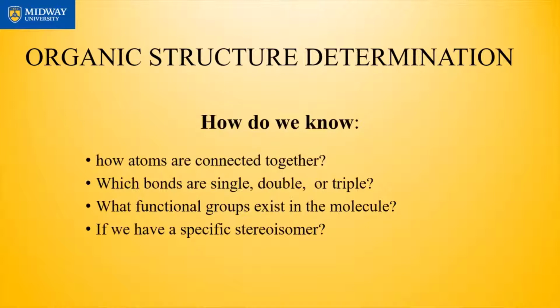But with infrared, we can identify what could have been the functional group, because people have historically established certain frequencies for a particular functional group and correlated that, and it's been done repeatedly over years, so that it's become a norm that if you have this value, then there's a higher chance this could be this functional group. With that, you could narrow it down to whether it's an aldehyde or ketone or acid or ester and anhydride or double bond or triple bond, alcohol, all kinds of stuff can be obtained from infrared.